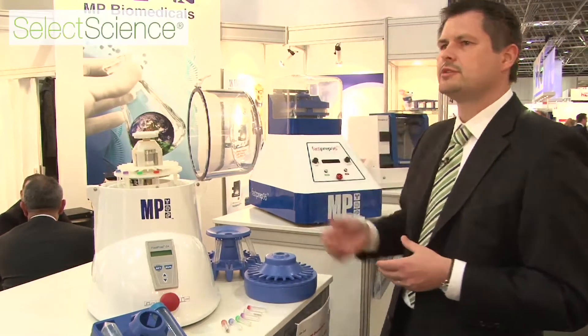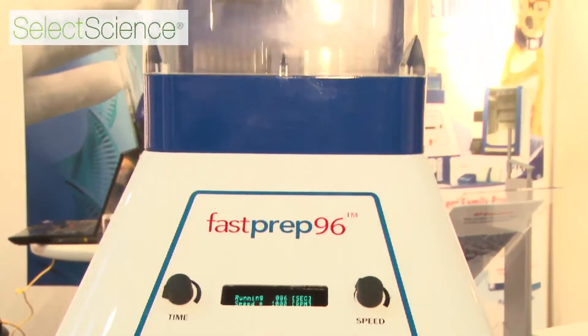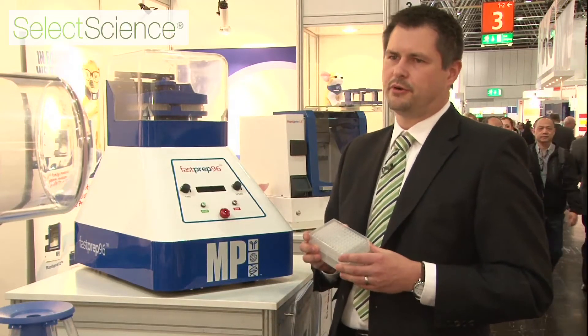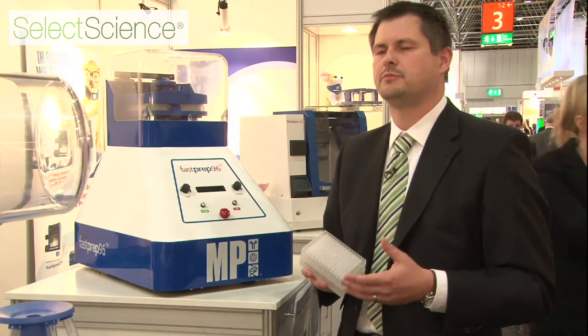The second machine I want to talk about is the FastPrep-96. It is the second offspring of this family and is designed to address high throughput research and drug development. Basically you can do all the things you do with the FastPrep-24, but you can do at least 192 samples in parallel, because it works with 96-well plates, also with different matrices and all the different kits that we can provide to help your research.